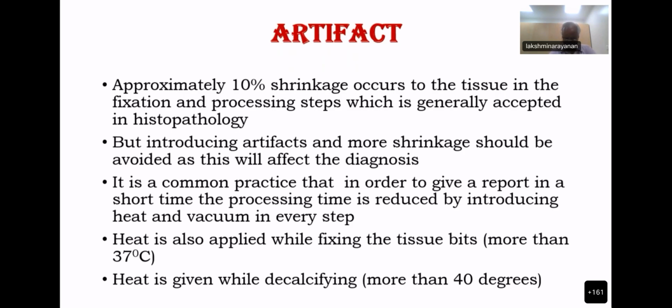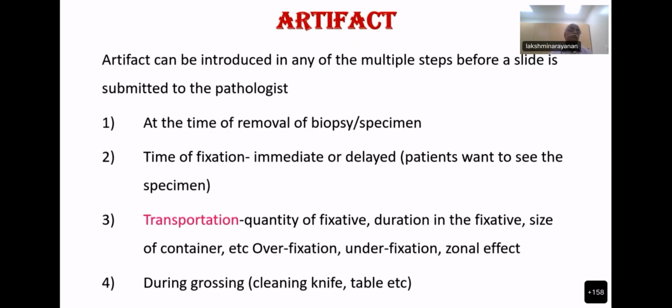In the case of decalcification also, 5 days, 6 days of decalcification, nobody will tolerate, the patient will be harassed, and doctors will say why the report is delayed. So people give 50 degrees, 60 degrees while doing the decalcification. So nothing will be seen as morphology, nothing will be there. I will show you a picture a little later. Then the artifacts can be introduced in any of the multiple steps before a slide is given to the pathologist.